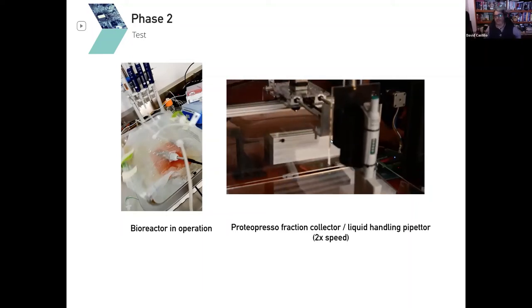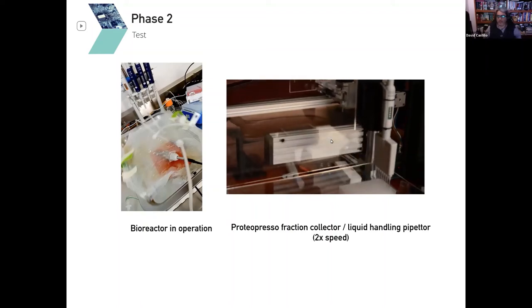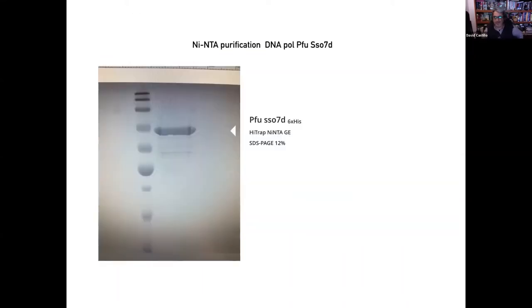There are still many features that need to be incorporated, for example selecting the volumes and adjusting for different types of pipettes. So far we can quickly demonstrate that it's capable of volume dispensing in different types of vessels, including these microplate vessels. And we're still working on that. We wanted to have this slide, but technology sometimes is not helping you, so I'm going to apologize for that.